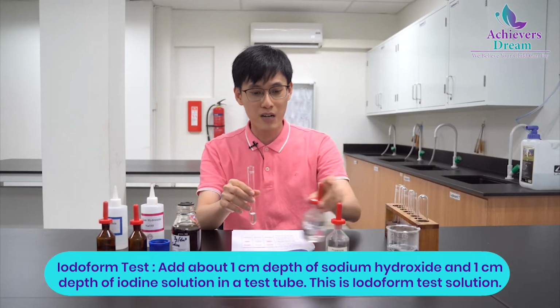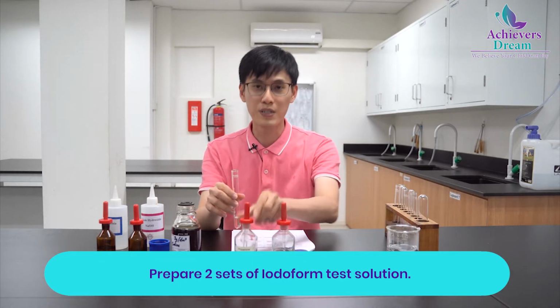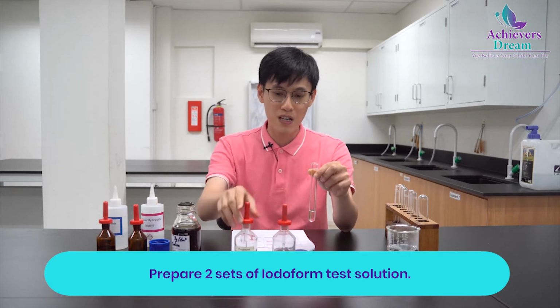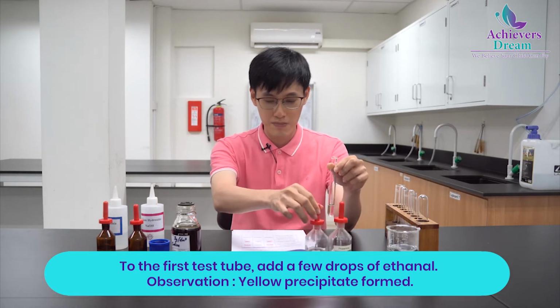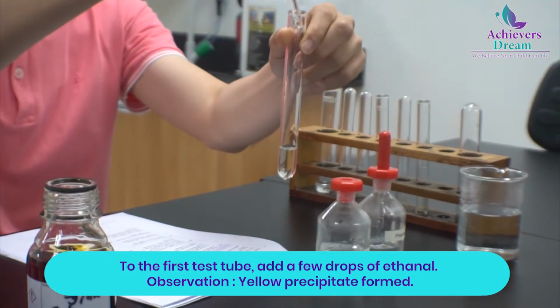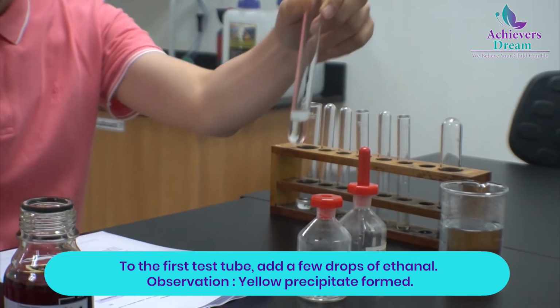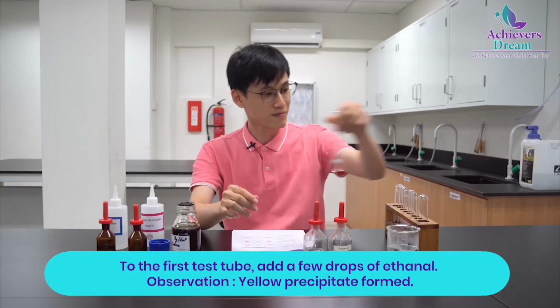Here we have 2 carbonyl compounds, ethanal and propanone, both of which have the iodoform group. So we expect to see yellow precipitates for both carbonyls. Let's try ethanal first. Let's see if a precipitate appears. Oh, look! Yellow precipitate of iodoform again.